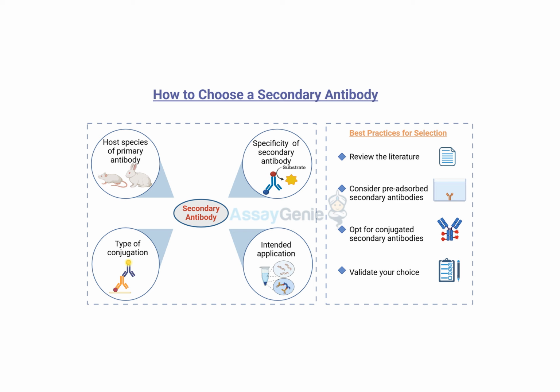Yeah, and how all of that relates to your specific technique. And like you were saying earlier, don't underestimate those controls. Absolutely. They can really help make sure your results are accurate and reliable. It's about avoiding those false signals that can derail your whole project.